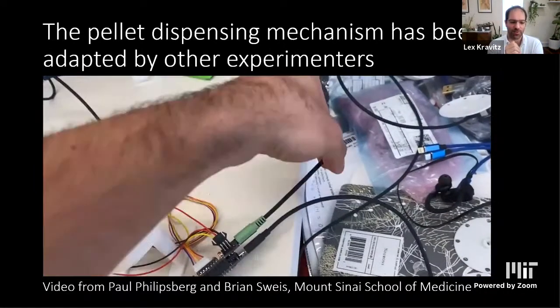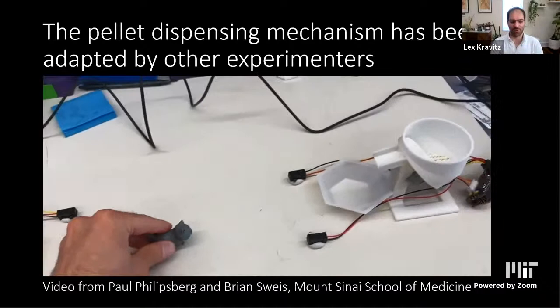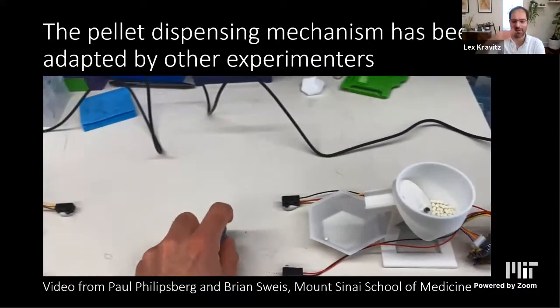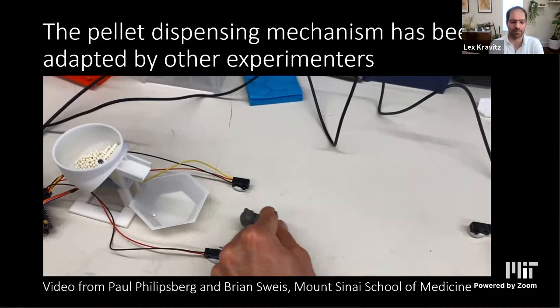And they're running a task where they have 2 of these connected by a cable so that they can have an animal go on one side and get a pellet, and then the computer can know that he's already gotten a pellet on this side of the maze. Let's now give him a pellet on the other side of the maze, and the animal is induced to alternate back and forth to get pellets.